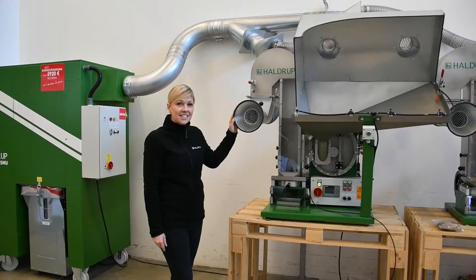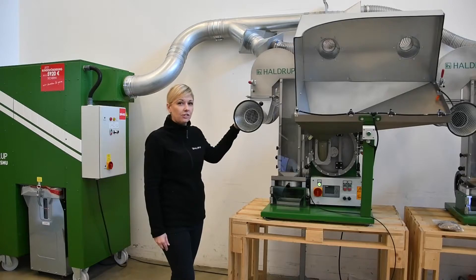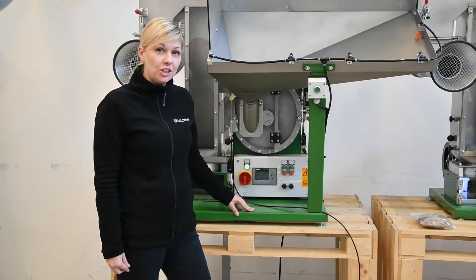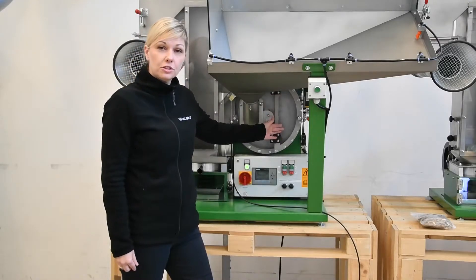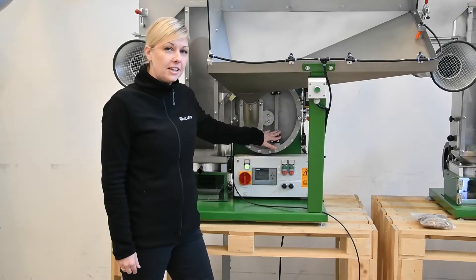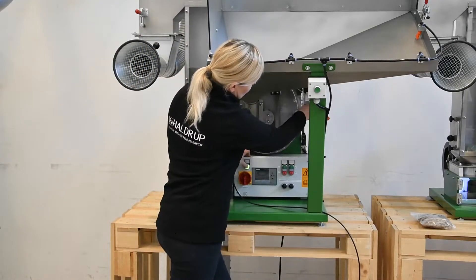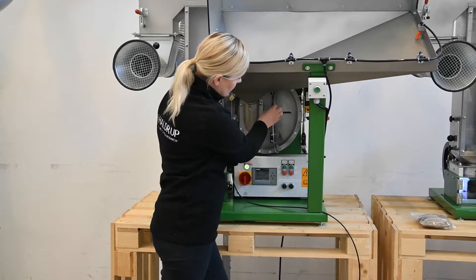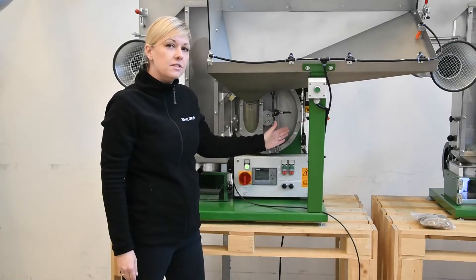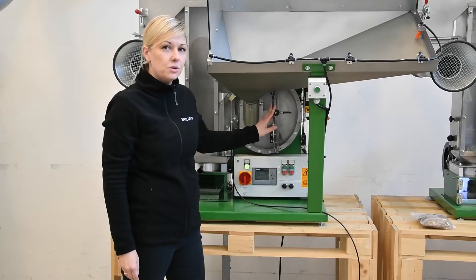As you can see, this machine is now attached to the SMU dust extraction unit. Another additional option for this machine is an opening on the threshing unit — an additional door which can be very easily opened for inspection or control. And also if some material gets stuck inside, you can very easily get it out through this door.